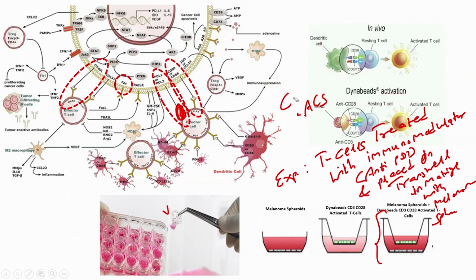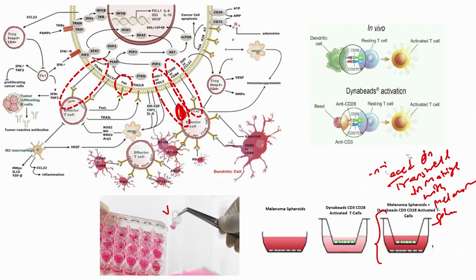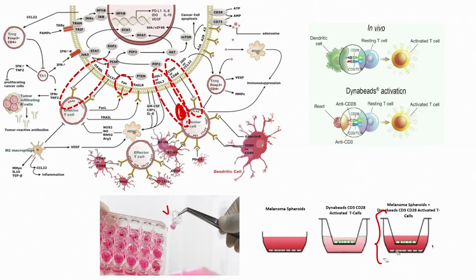Okay. So, now my point is, is our body static? No. What is our body? Our body is dynamic. When we take a drug, does this drug go to a particular place and stay there? No, it flows with the help of blood, right? It mixes in the blood and flows through the blood. So, why perform static experiments when our body is not static?